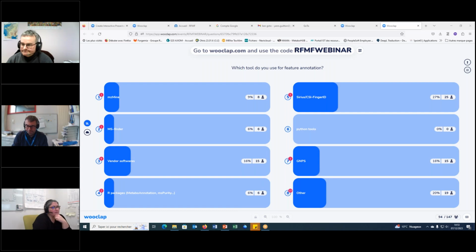That's my opinion. Okay, and maybe the last one before switching to Melanie. Are there any new recommended tools and or libraries for GC-EI HRMS from eClass?